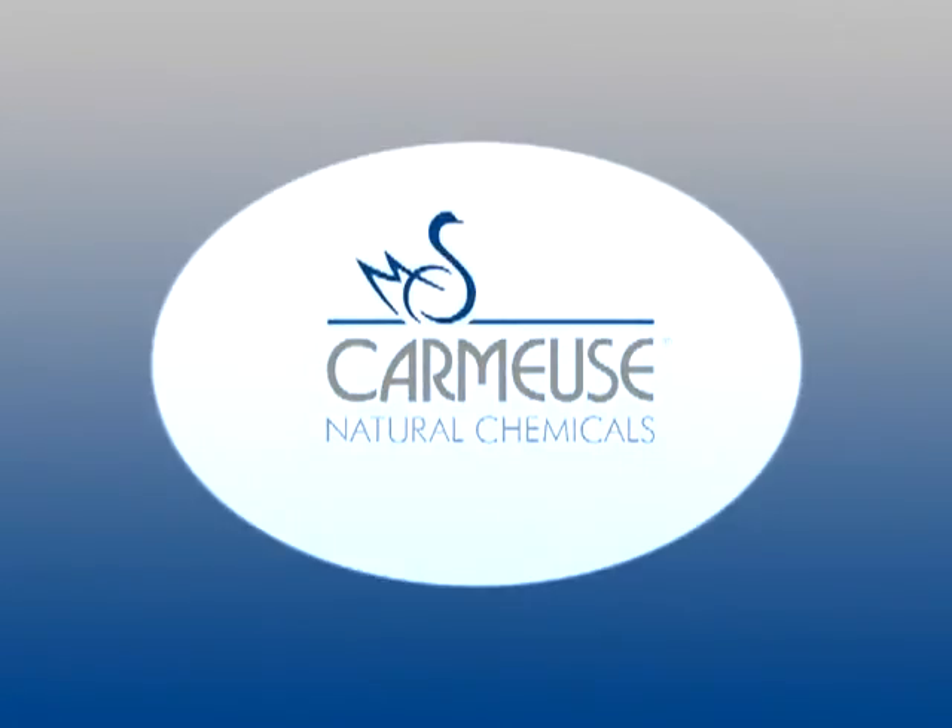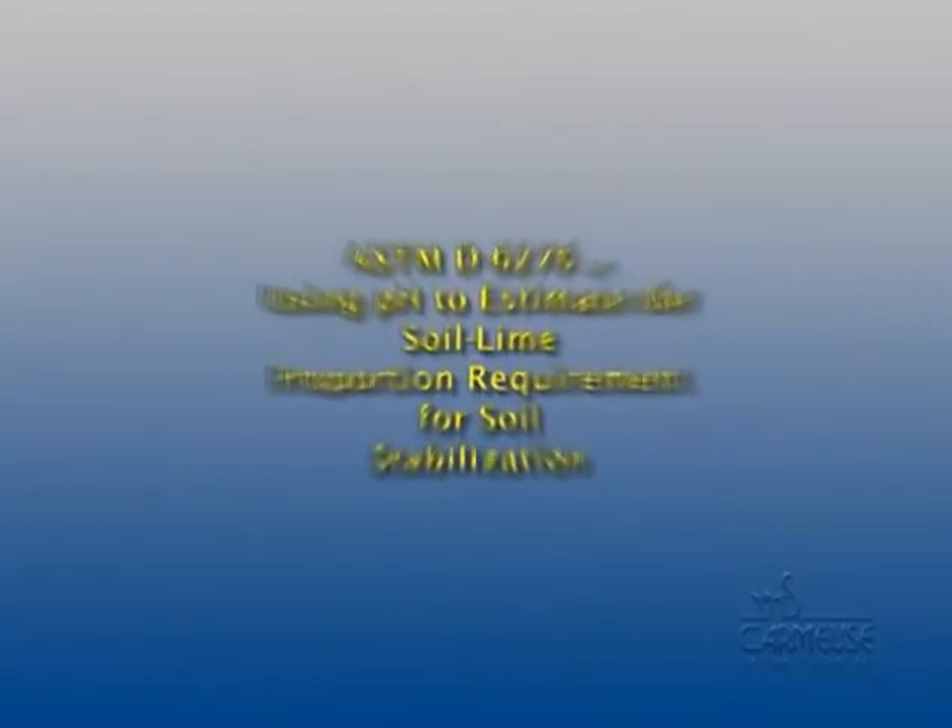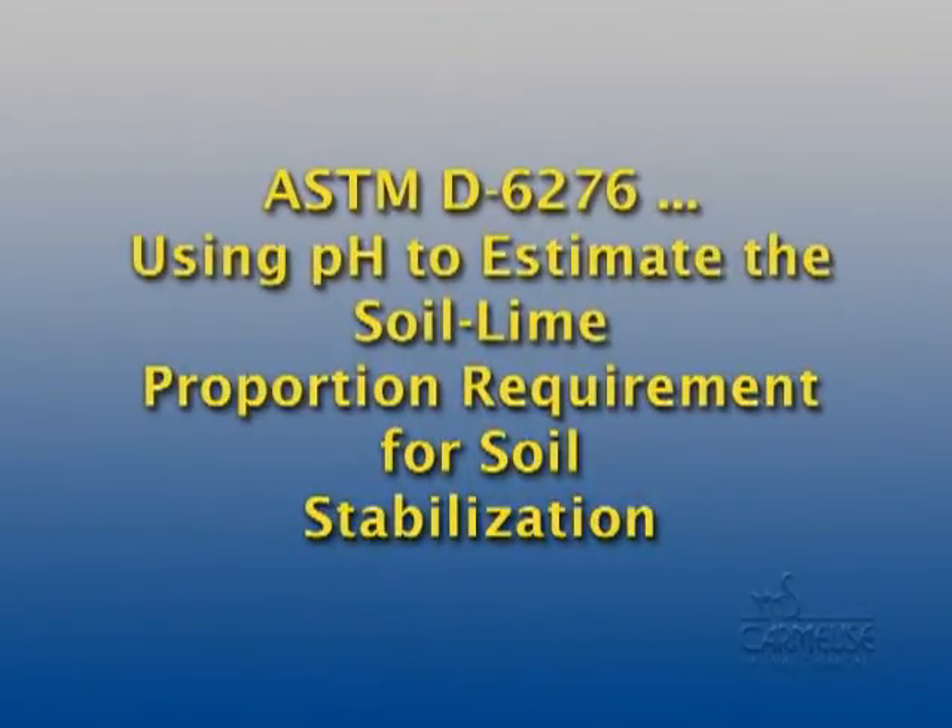Carmoose Lime and Stone presents ASTM D6276, also known as the Eads Grimm Test, using pH to estimate the soil lime proportion requirement for soil stabilization.